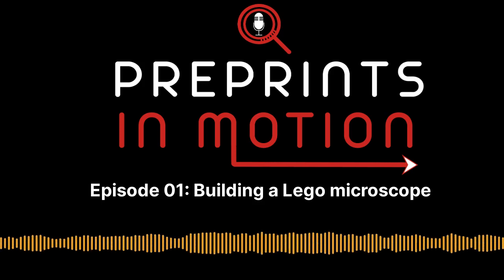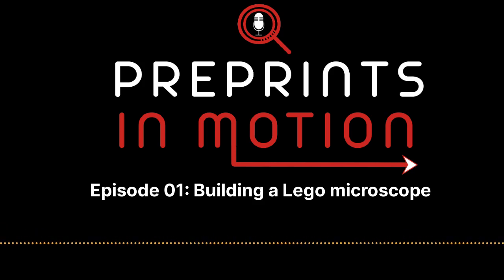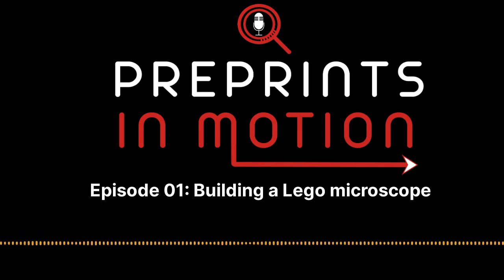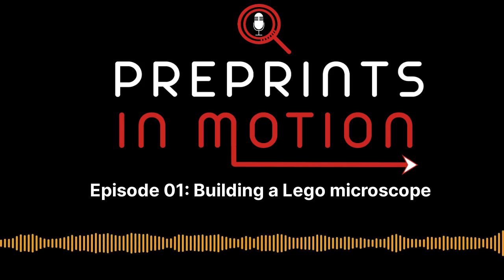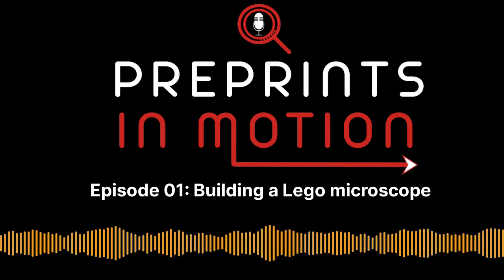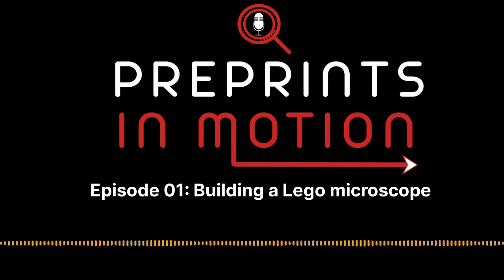Yeah, so one of our objectives for the microscopes we primarily use is about £60,000. That gets you 600 Lego microscopes. Yeah, it's not something you want to drop and break. It's a little bit terrifying every time you have to change it. That's another advantage of the Lego microscope. If you drop it and it breaks, you can just reassemble it. You can put it back together.